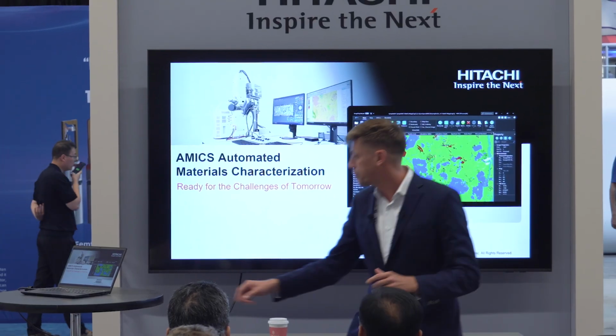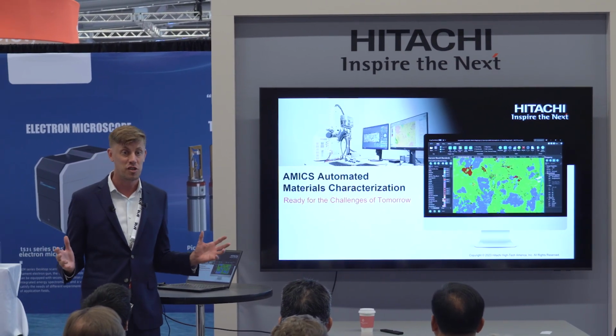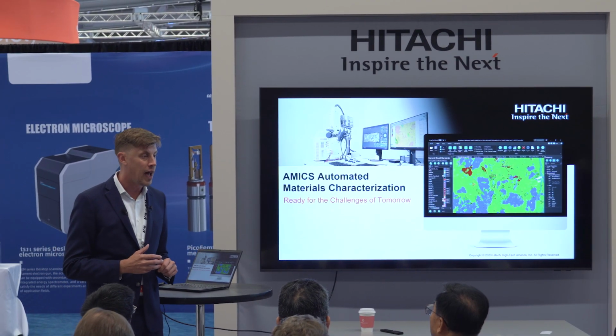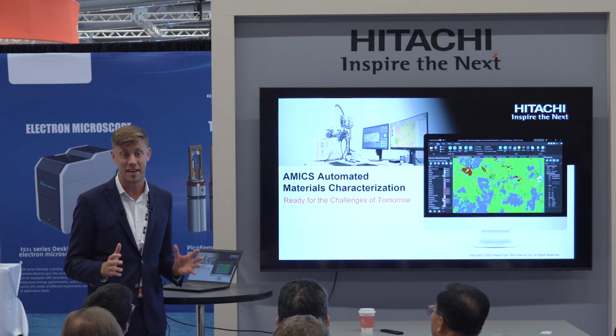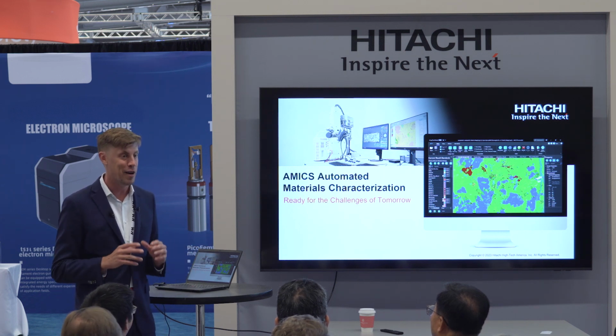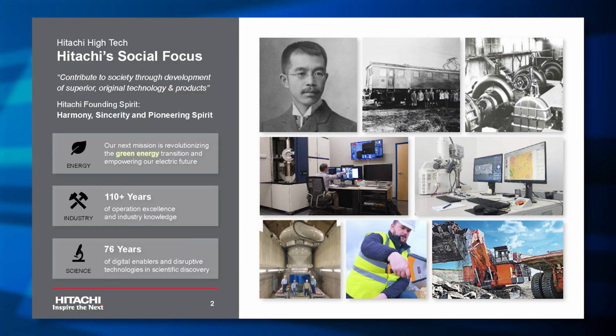So today, my background is, my PhD is in geology. I'm a sedimentologist by training. But I have my examples today. I only have a few oil and gas examples, so you're all welcome for not boring you to death with porosity. But we're going to get into some really cool stuff today about what we can do with automated materials characterization on the Hitachi SEMs.